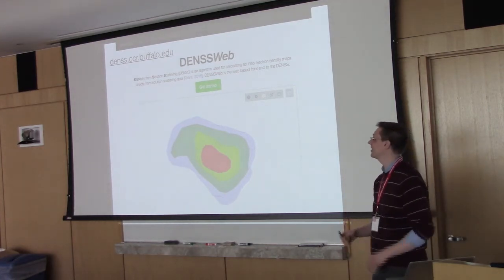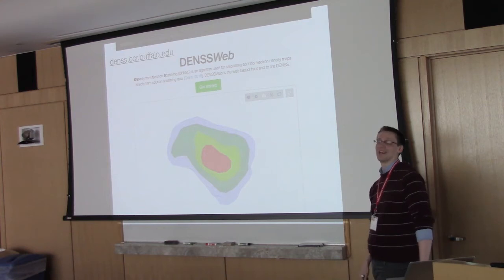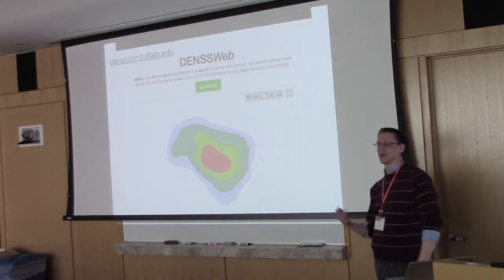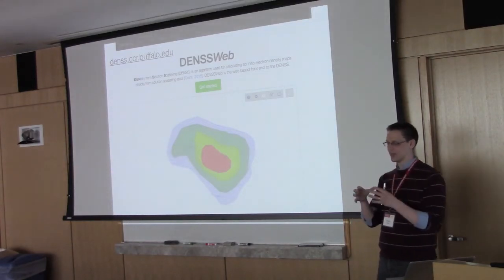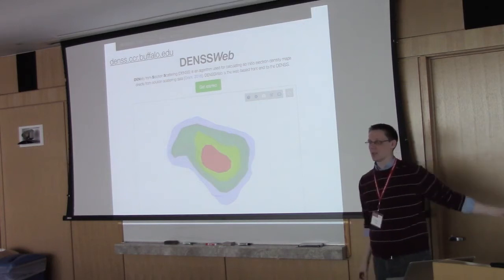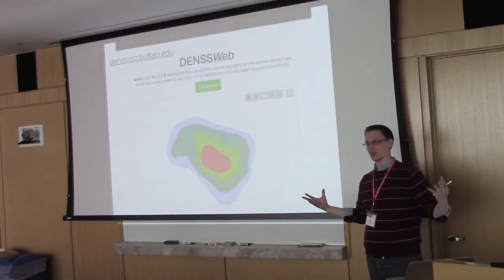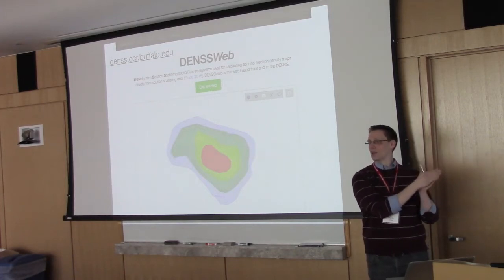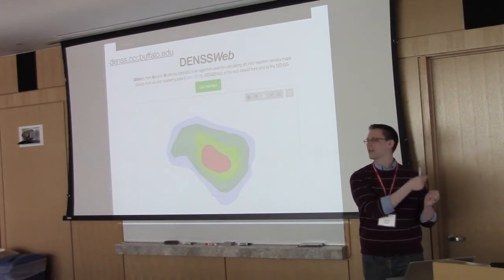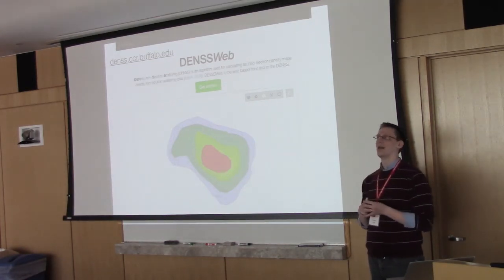Yep. So that was actually mainly the one case that I had to develop this connectivity thing for. For most simple globular things, it'll generally converge to a single blob. For that one, it had like 12. And so that was when I told it to look for all the blobs. What would happen is there's these blobs, and then there's blobs really far away. And even though you would think that these really disconnected blobs would have a big impact, because they're so far away, the scattering vectors are extraordinarily small Q values, and so it doesn't really impact the fit all that much. But each one of the blobs will often look like this dumbbell thing.